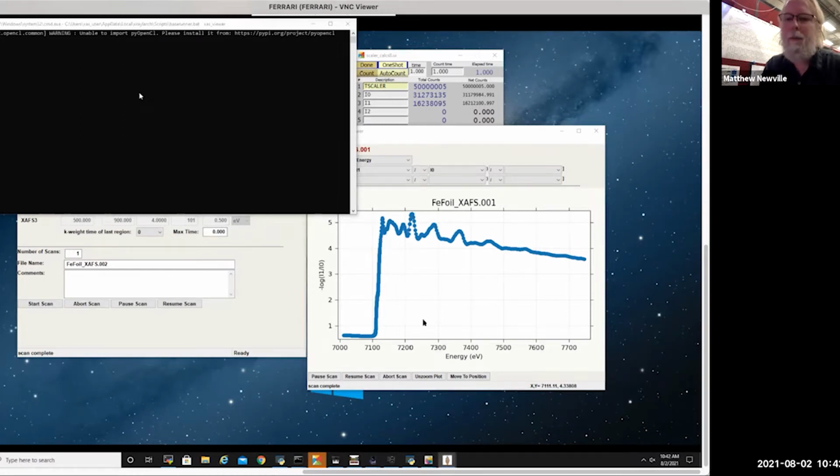And then there's a question from Manuel: are you planning to later do an example like this for a HERFD measurement? I am, so I should say we do HERFD at our beamline, but we're not set up for that today, and I'm not going to do a HERFD measurement today. No, I'm not doing HERFD today. We'll do micro work instead.